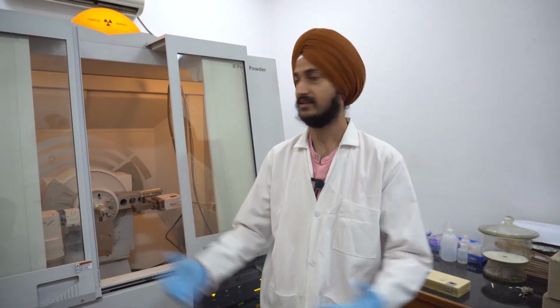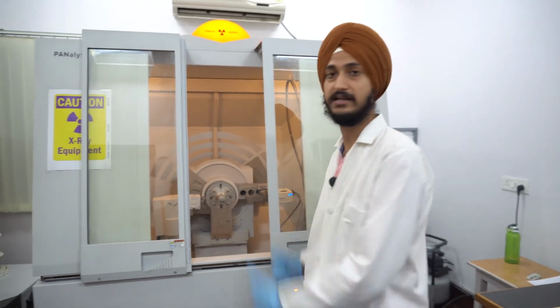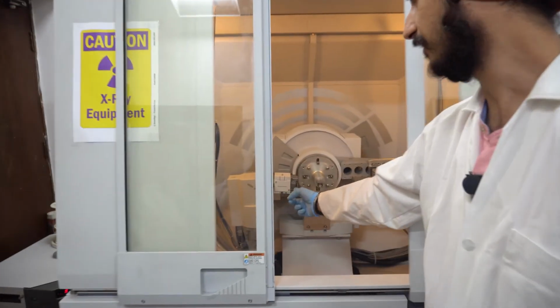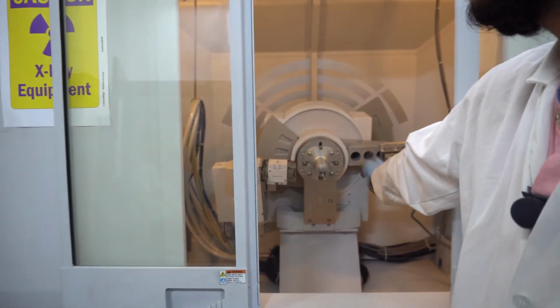Hello everyone. I am Amritpal Singh Chaddha, working in the XRD lab. I take care of this XRD lab in the Birbal Sahni Institute of Paleosciences. As I told you in my theory class, now I will give you the practical feel of the XRD instrument. We are using a PANalytical X'Pert3 Powder instrument which uses a copper source and Bragg-Brentano geometry, where the sample stage is fixed and the detector is variable.